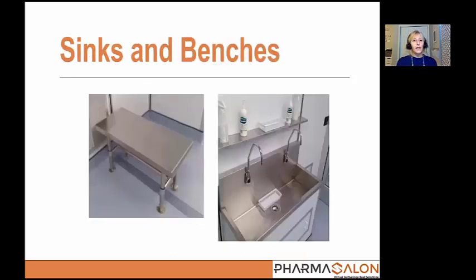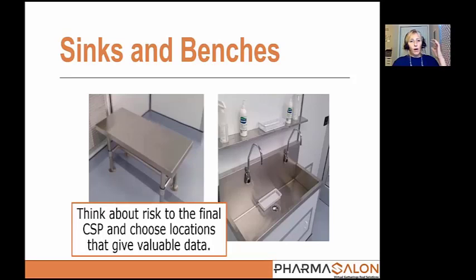All right. Sinks and benches. These things exist in our ISO class 8 environments, so let's take a look at these. I'd like to start talking with this, again, in that mindset of, all right, what's the risk to the final CSP if we have microorganisms on these surfaces?